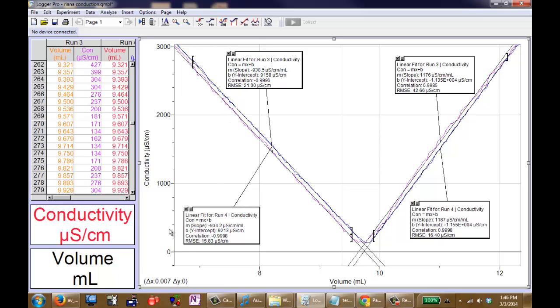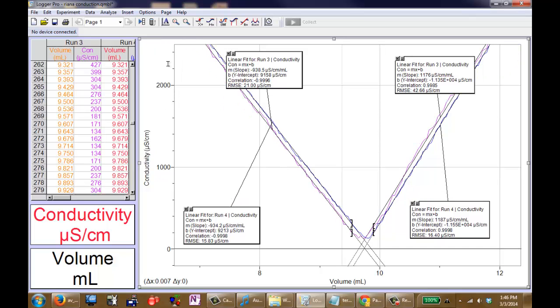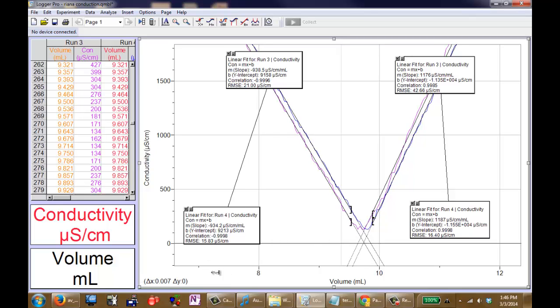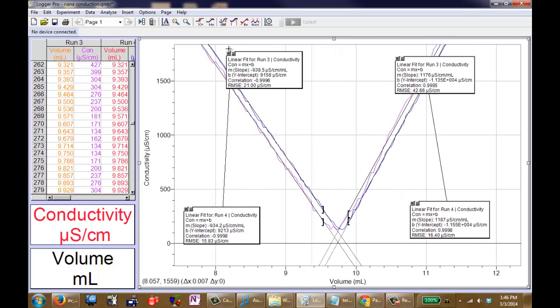I'll zoom in here so you can have a closer look at those points more clearly and get a better view of the data in question.